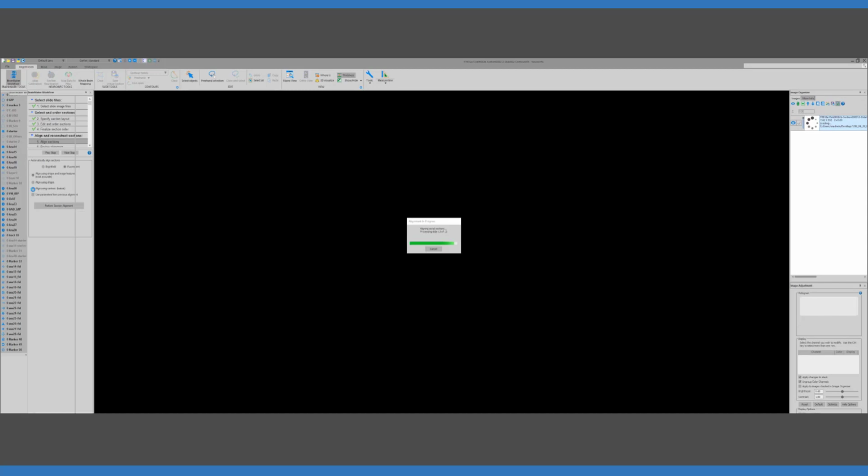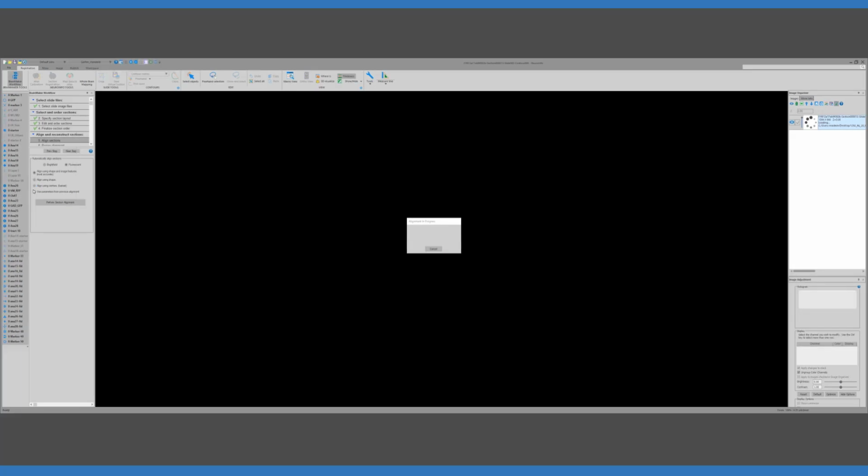It looks like we're just about finished up with the automatic registration here. So again, depending on which of these three options one uses, it changes the amount of time. For this brain, if there were 120 sections, which there were, it might take up to 15 to 20 minutes, or even up to half an hour to do that with the most accurate option. Doing it fast, it would take like 5 minutes. Anyway, after we've done that, we go on to the next step. It says the alignment was successful, so click the next step.